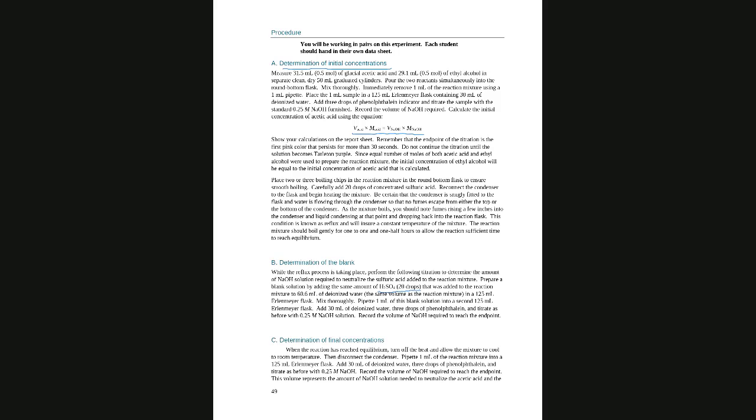And while it is heating all that mixture, you can do the blank. So basically, you titrate 1 ml of the blank with sodium hydroxide. And we don't have to go over the equation because it is always the same equation, this one. For part B, we don't have to do any equation.